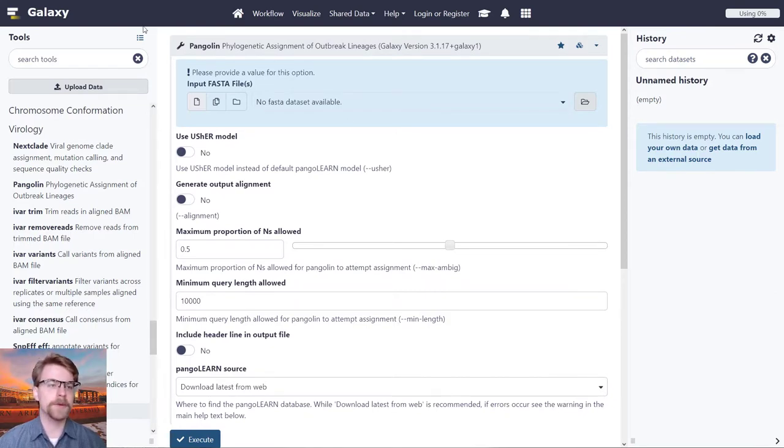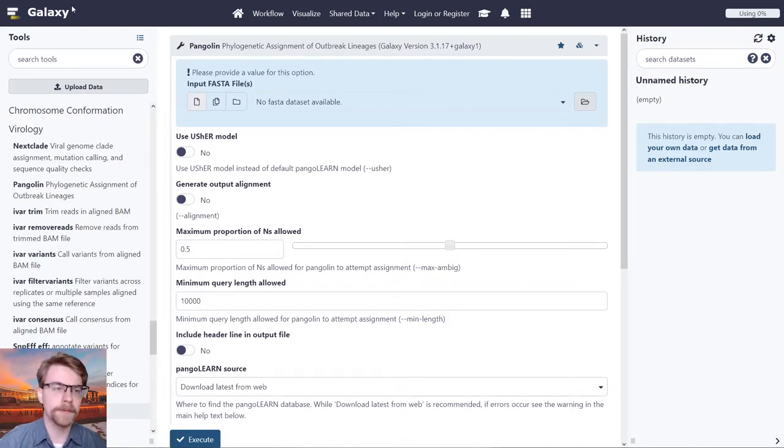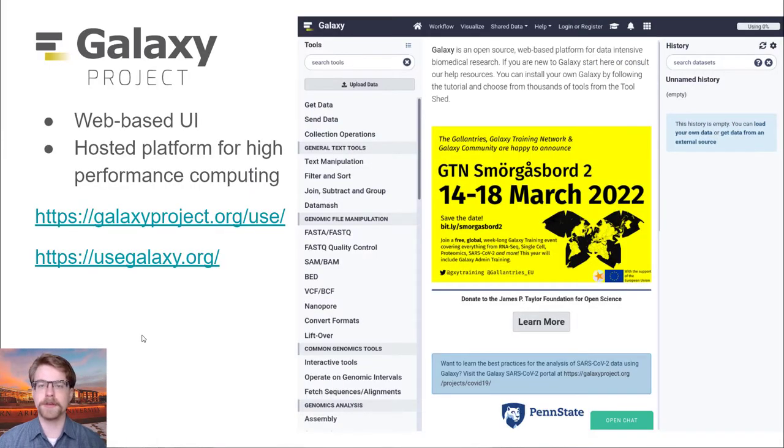Now, for this workshop, we've set up our own server, which you'll be interacting with. And this server uses QIIME 2.